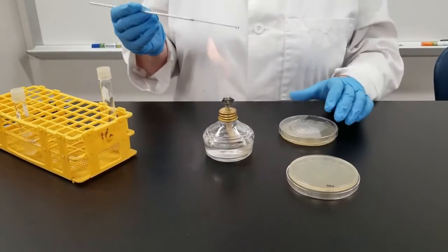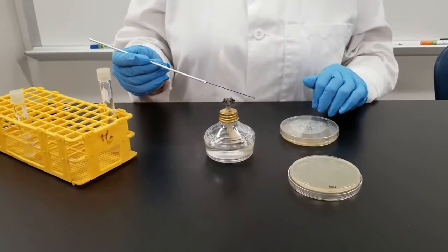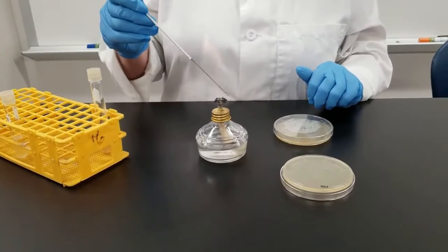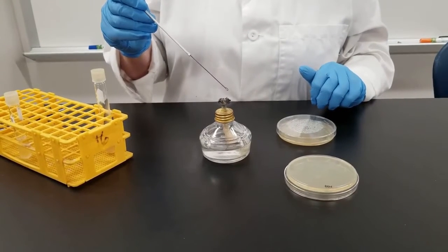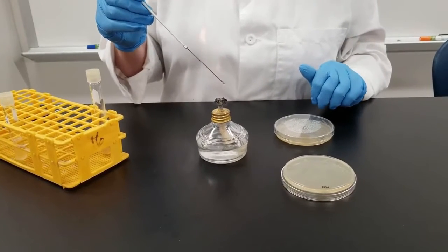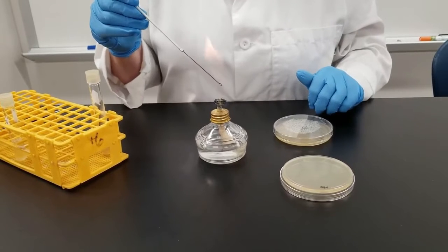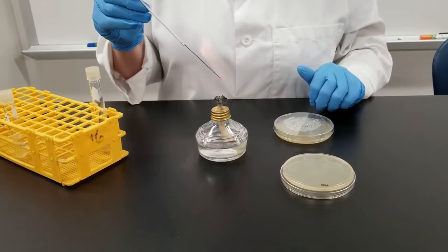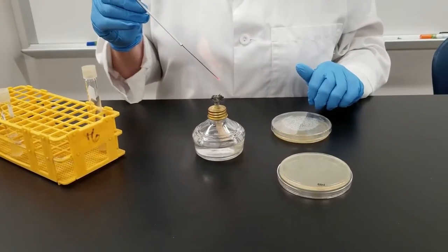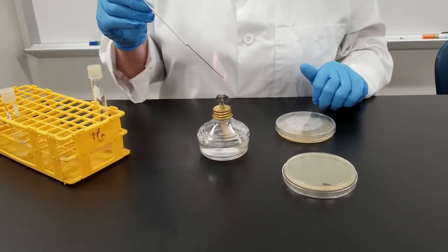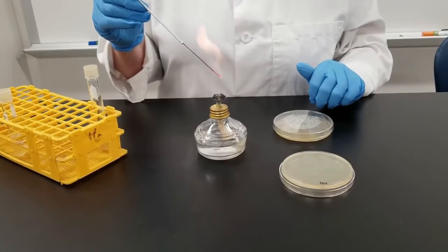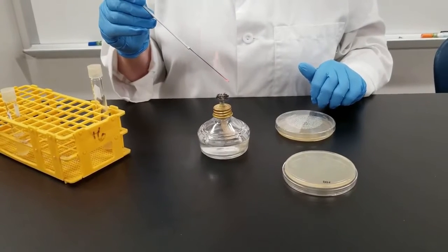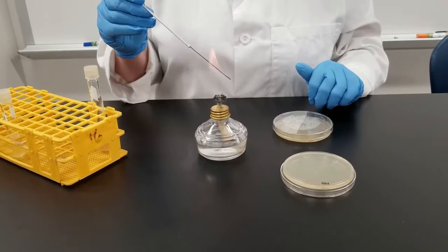What you need to do to start off with is take your inoculating loop. In this case, we are using the loop. You need to stick it into the flame. This is an incineration, a way of sterilizing that loop. You're literally burning everything off. You want to get it where it's glowing nice and red. That kills everything that has been on this loop.